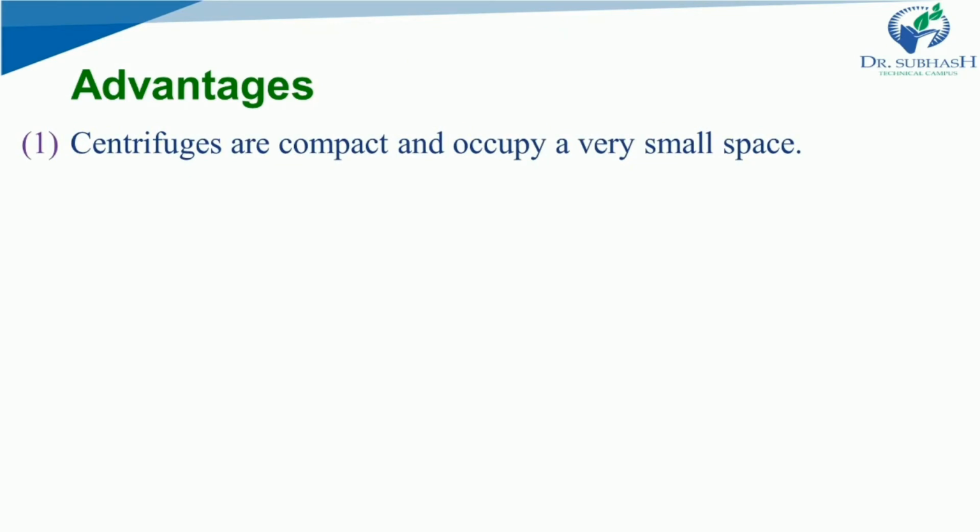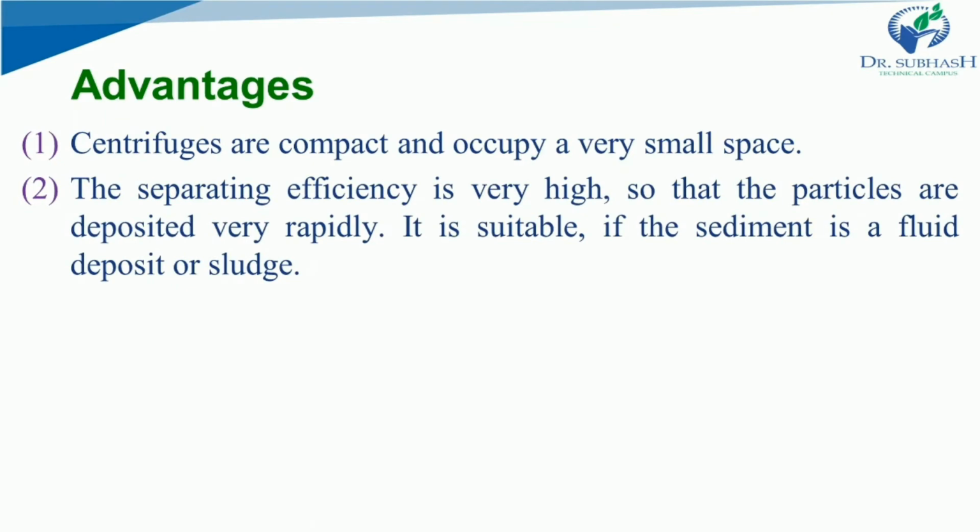Advantages of this type of centrifuge that works on the sedimentation principle: centrifuges are compact and occupy a very small space. The centrifuges which solely depend on the mechanism of sedimentation have a really mini size, so you can fit them in your lab too. The separating efficiency is really high so that the particles are deposited very rapidly.